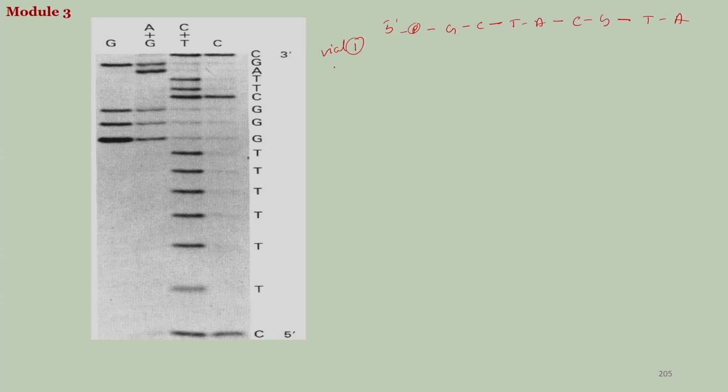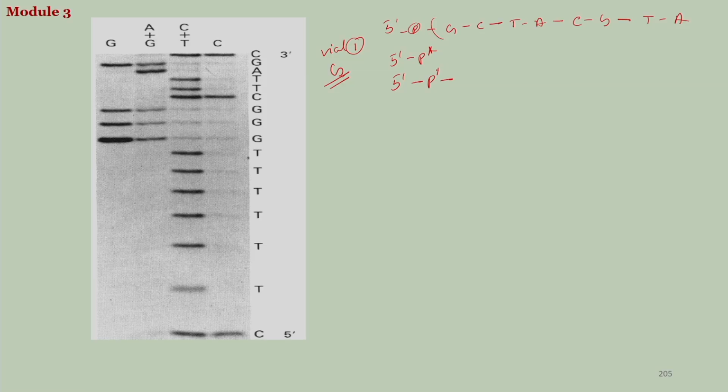We now call it a G, because vial 1 will cleave only the G, not the A. So, fragments. The first one is G, G would be chopped off here, it is gone. So, you are left with only the phosphate. Next P, I have to write the phosphate all the time because this is one band that you are also getting.